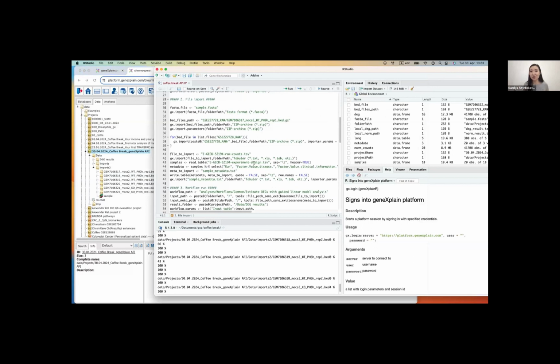And this is also an advantage. Sometimes files like FASTA or FASTQ files can be very, very big, exactly, GBs of data. So just waiting for them to import into the platform might not be very convenient sometimes, and this is a good alternative: to have a script which will just upload it from your system automatically.